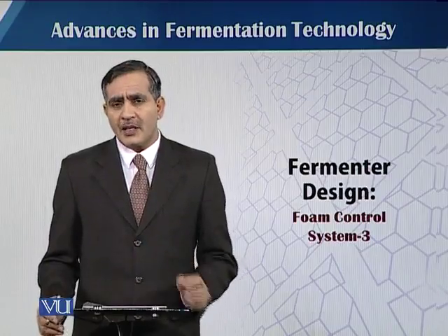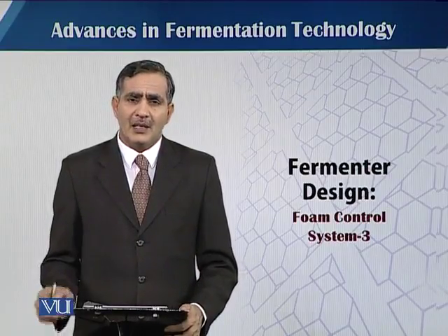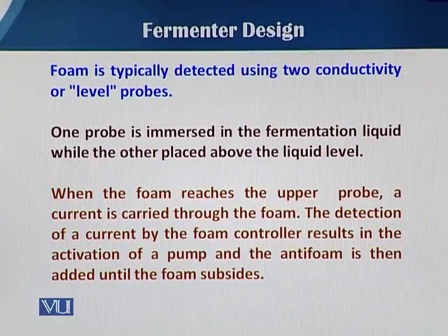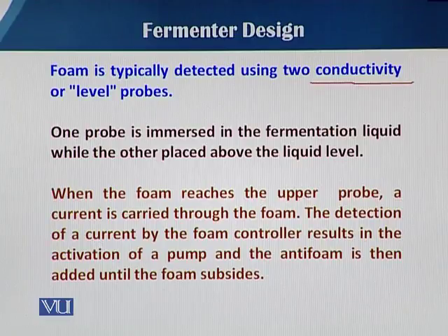As concerned the automatic control system, there are different probes which first sense the formation of the foam. Foam is typically detected by using two conductivity probes, which we call level probes. If you study the literature, wet-on and wet-off probes are mostly reported.